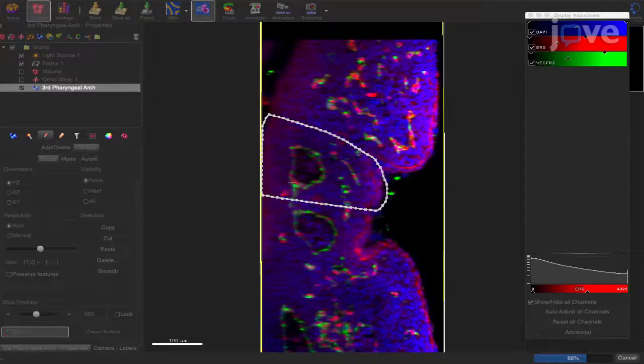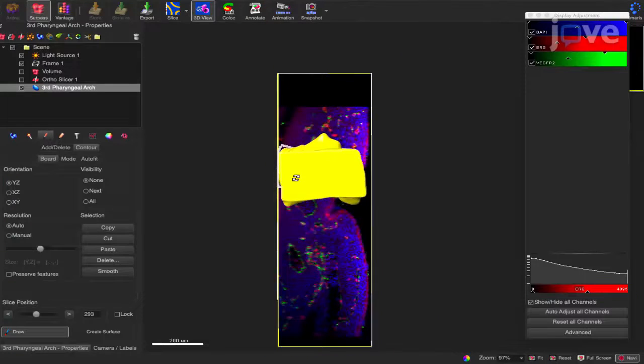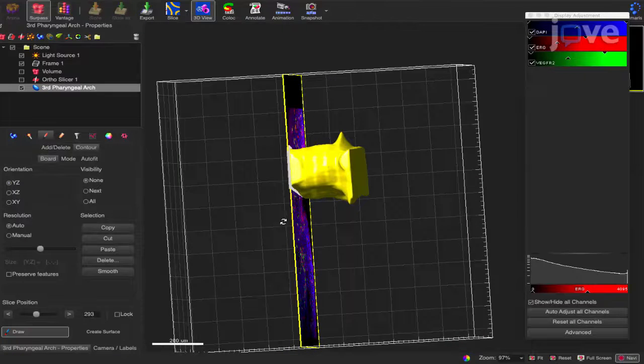Aortic arch arteries are commonly mutated in congenital heart disease. Our method allows the study of how mutations alter the physiological process of vessel formation and remodeling. Although we use this method to gain insights into the mechanisms of congenital heart disease, it can be applied to other systems, particularly with the advent of light sheet microscopy.